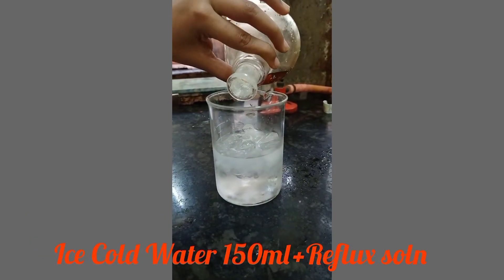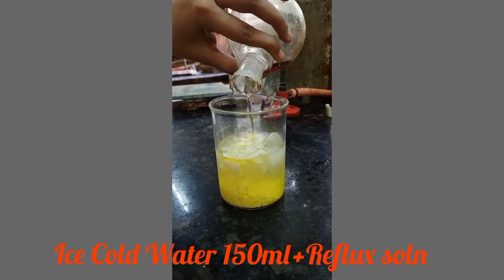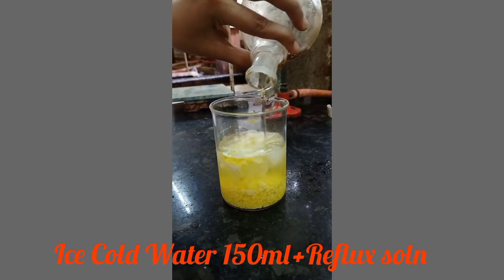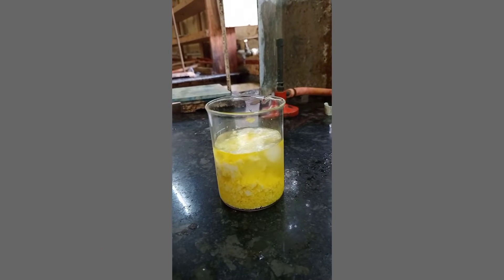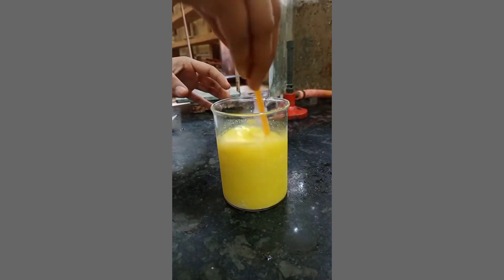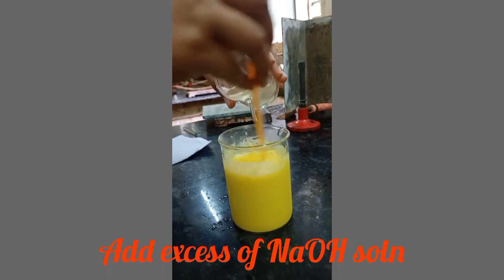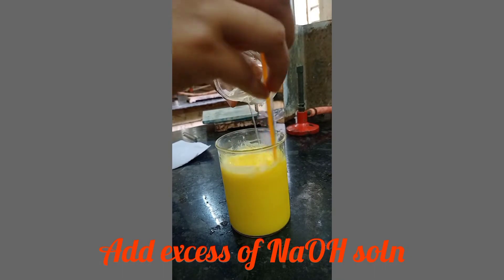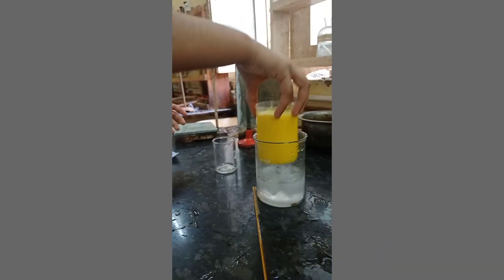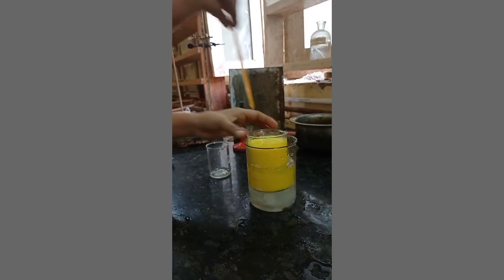Take 150 ml of ice cold water and pour the reaction mixture into it — you will get a yellow precipitate. Stir the mixture and add excess NaOH solution for complete precipitation, then place the whole reaction mixture in ice cold water.